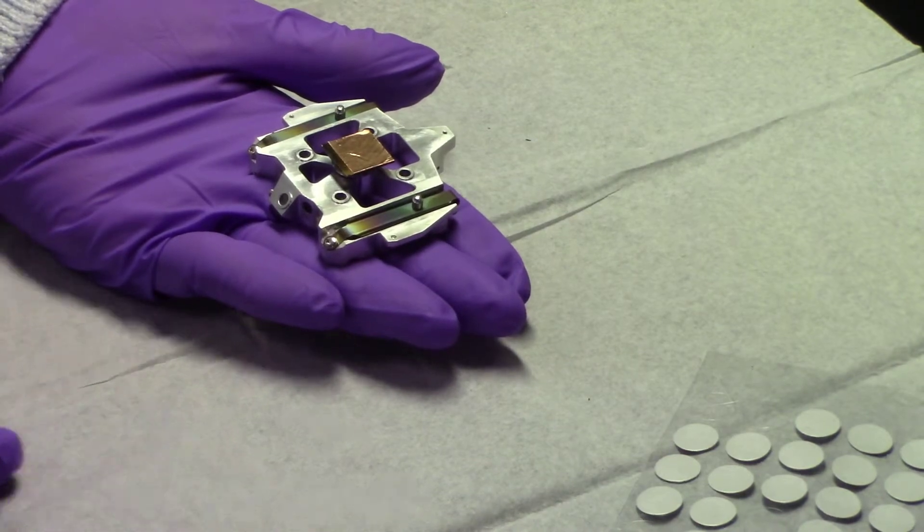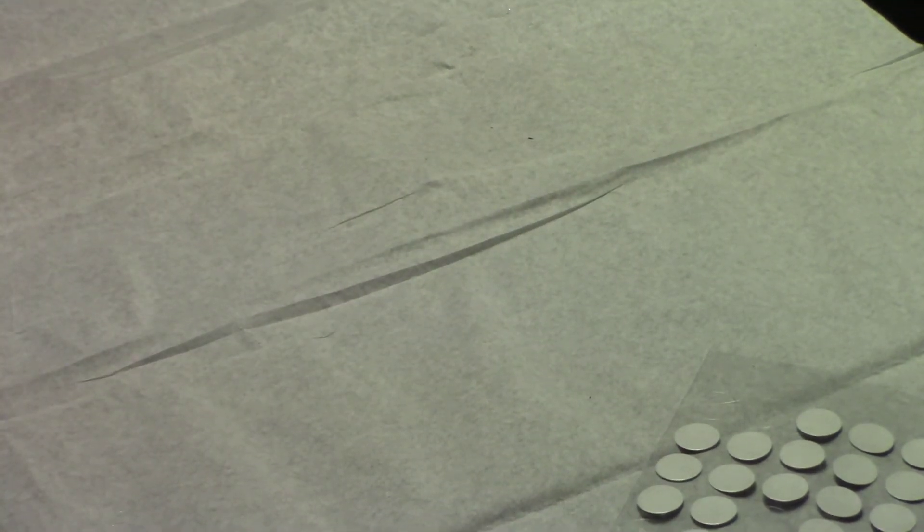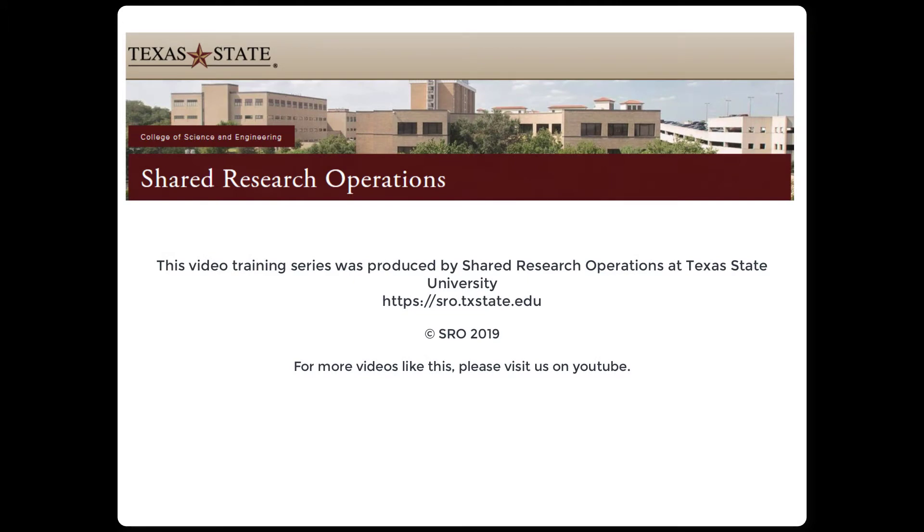Once your samples are secured in the shuttle, you're ready to load the shuttle into the SEM.